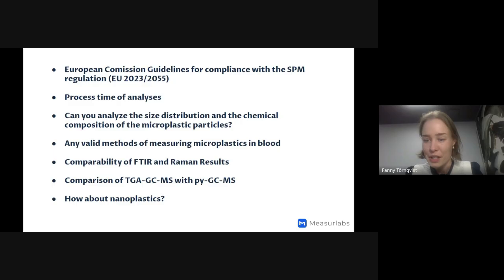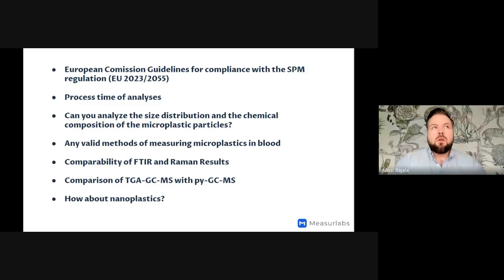Then continuing on the different types of samples, Pavelkova is asking, are the methods appropriate also for samples in non-water solutions, for example samples in ethanol, isopropanol, methanol, or hydrocarbon solvents? Yes, those should also be possible to analyze, quite rare, but that shouldn't be a problem because they can be easily filtered.